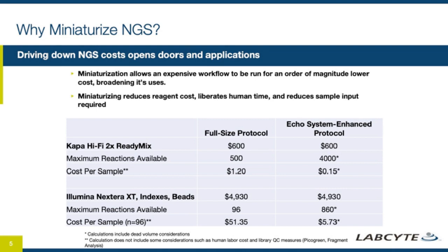Now, these are based on a tenfold reduction in volume. 20-fold reduction in volumes are possible, but oftentimes the magnetic bead cleanup on the back end serves to be the limiting step. And so we want to make sure that miniaturization makes sense, and that when we get to the end and run to the bead steps, that it's still a volume that can be handled.